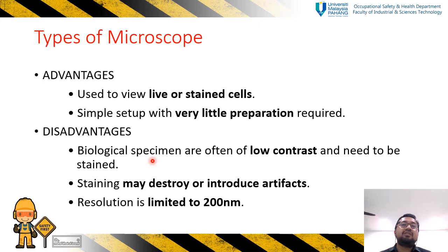And resolution is limited to 200 nanometers only.